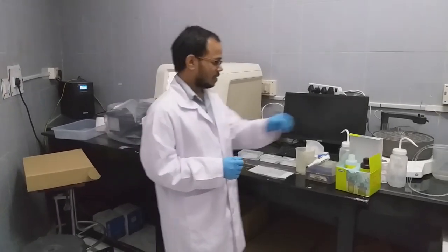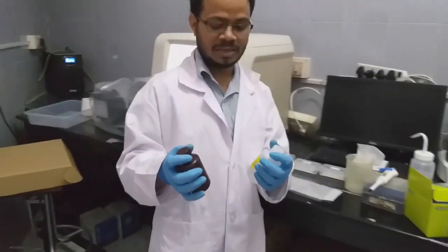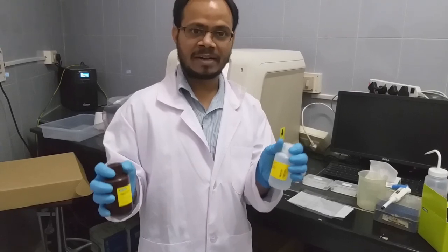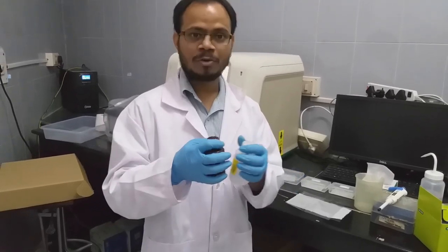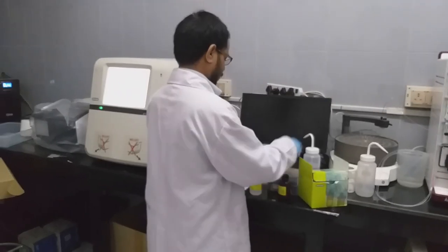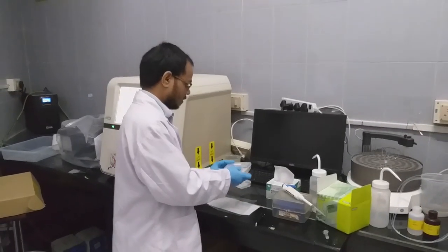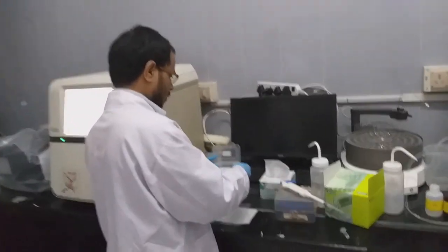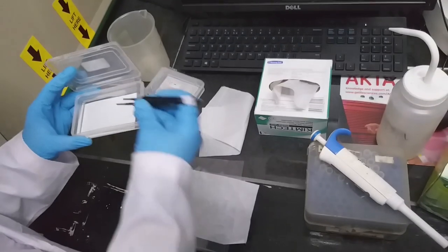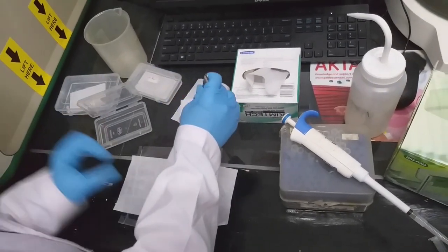These are the commercially available chemiluminescent substrate solutions. They are available from a wide range of companies. We have to mix them in a 1:1 ratio. So we have to take out the blot and drain whatever buffer is present properly.